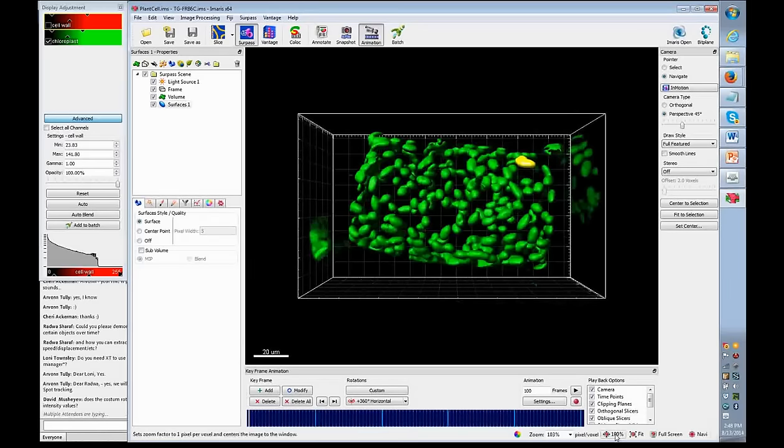or the exact volume of each of these objects, you might have to go with surfaces, which could complicate the segmentation process a little. If you have a time series, this checkbox won't be grayed out anymore when you add a spots object, and it will be checked by default.